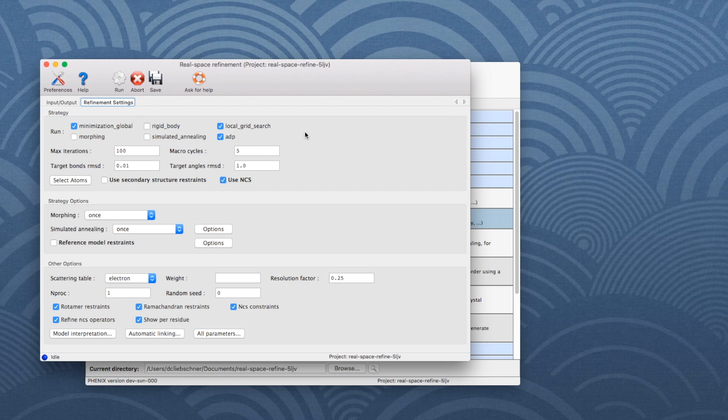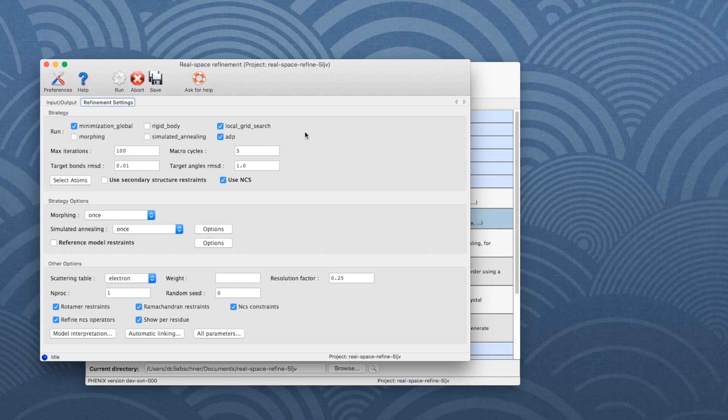The following options are also activated: Rotamer Restraints, Ramachandran Restraints, and C-beta Deviations Restraints. Note that the latter cannot yet be deactivated in the GUI.